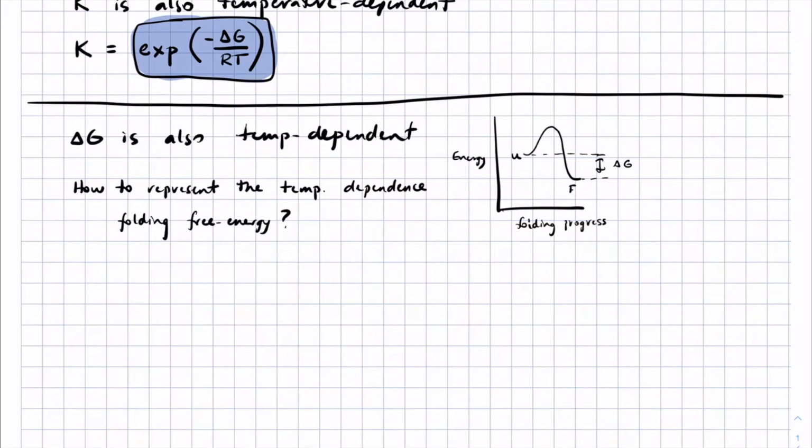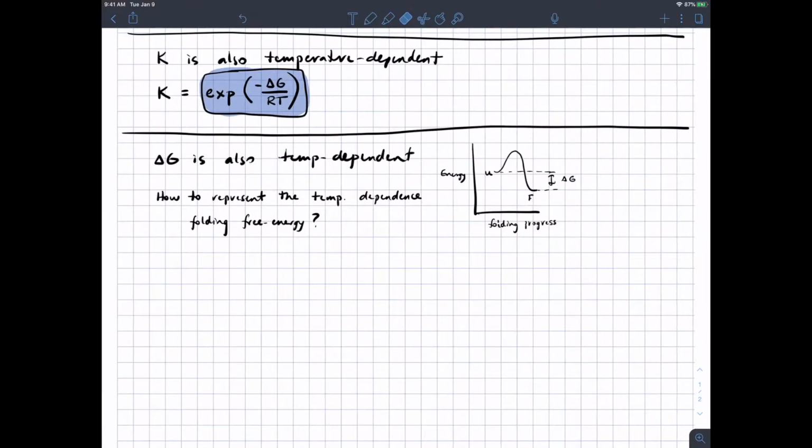All right, last time we were talking about the process of assessing protein conformational stability using variable temperature CD experiments. We had talked about the origin of the CD signal and some practical details in terms of how to calculate molar ellipticity. We then talked about two-state folding and the thermal unfolding transition that occurs with many cooperatively folded proteins as you increase the temperature. And we talked about how to fit those data.